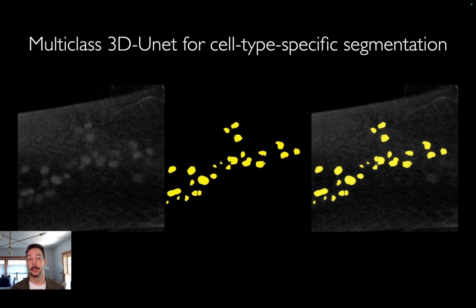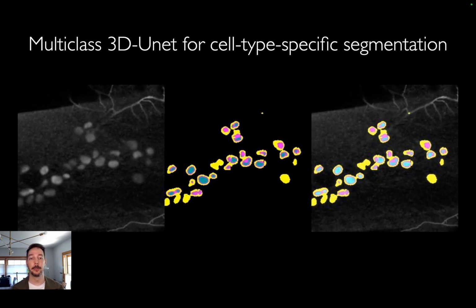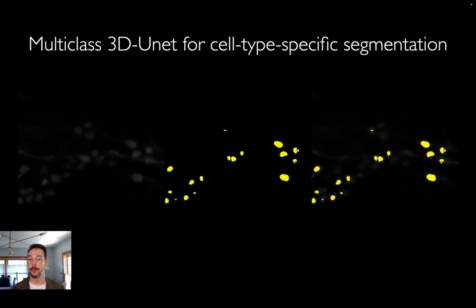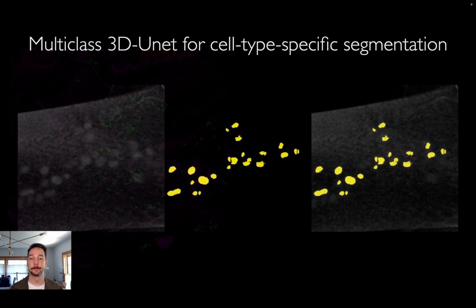And now you can see the immune cell mask overlaid. And this is actually an earlier version of the model. We've even improved upon this more recently, but you can see already this is accurately delineating the immune cells and even some of the faint cytosol, which is hard to see without close inspection of the image.